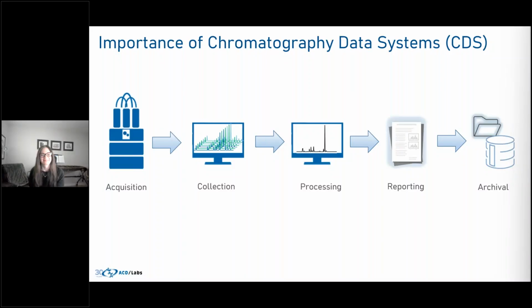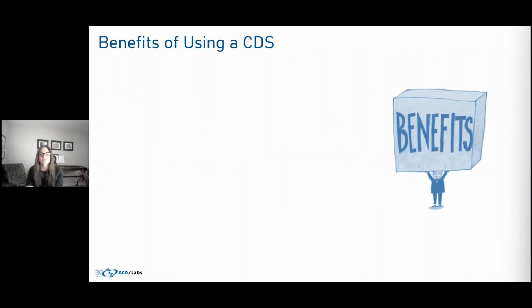Thank you, everyone. So now that we've learned a little bit about what method development systems you might be using, let's go into a little bit more detail on the CDS that you're probably using to collect that data, regardless of whether it's method development data or not. With any system, there's going to be pros and cons. So let's go over some of the benefits that CDSs have.